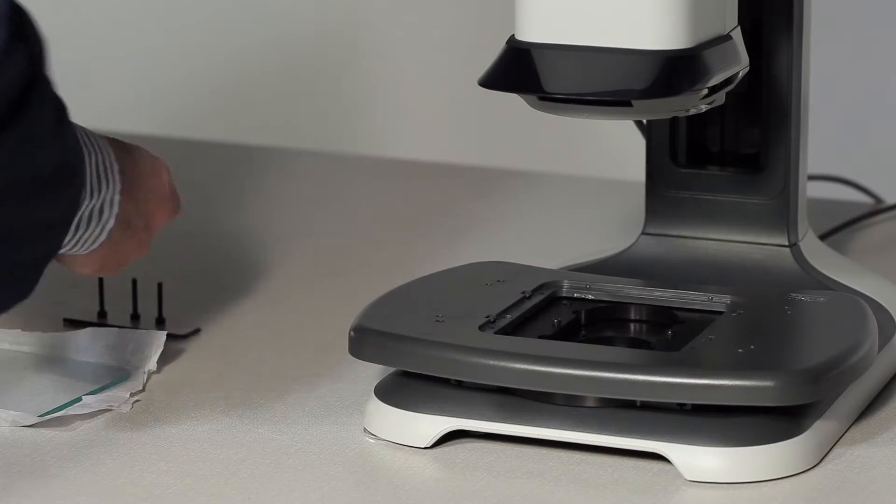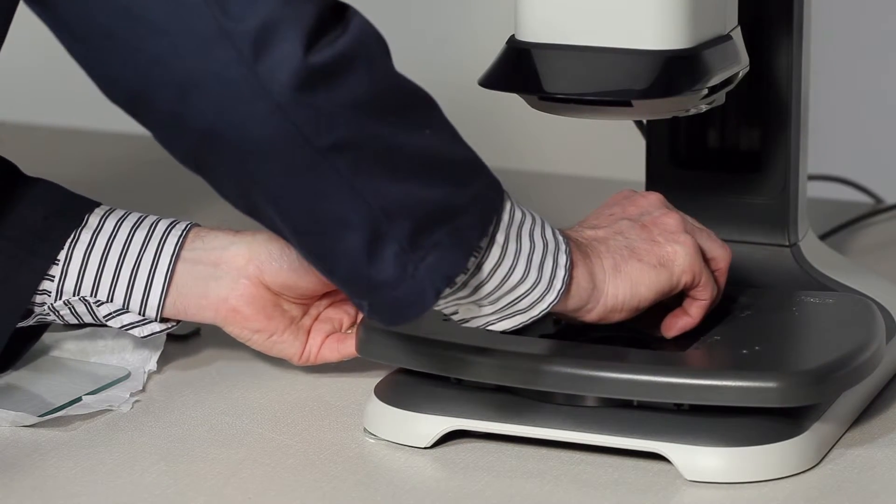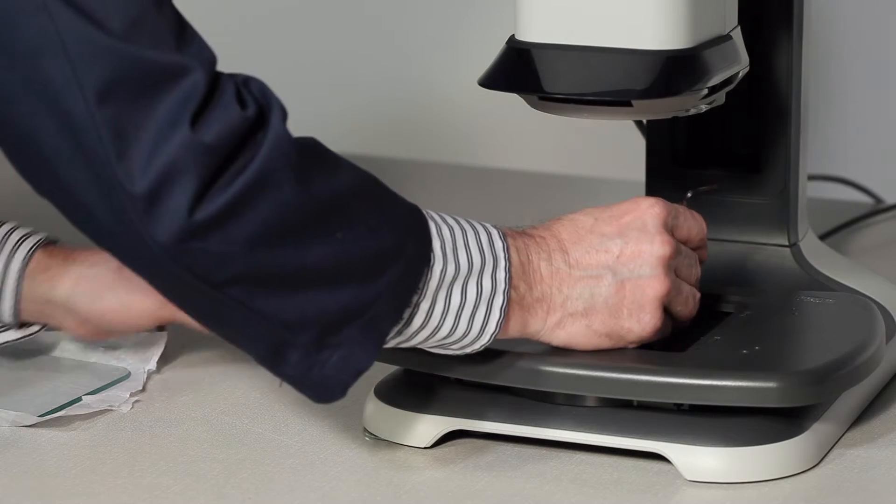Secure the stage in place using the four screws provided, making sure the screws are inserted fully. Failure to do so could inhibit movement of the stage.